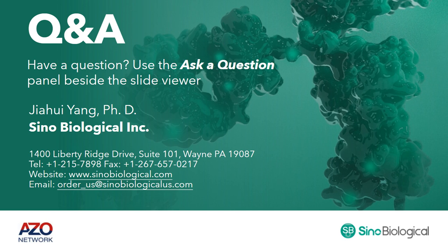Okay, great answer. And this leads us to another question here. Can positive clone rates be improved by using antigen-specific B cells for cell fusion to obtain hybridomas?